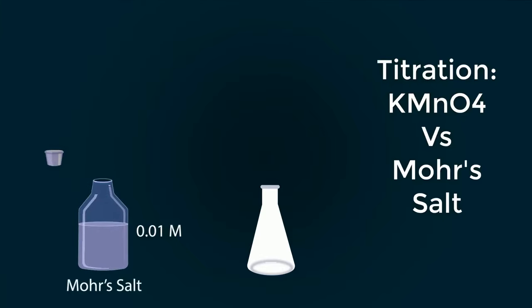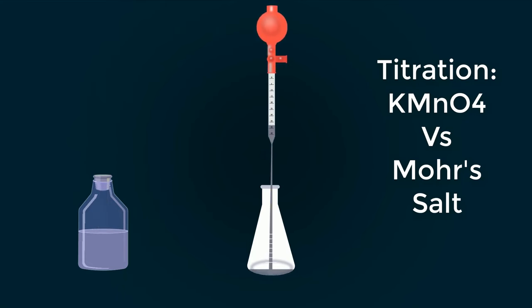In this video, you will learn how to find out the concentration of KMnO4 with the help of titration.